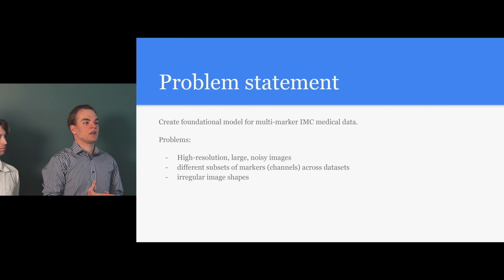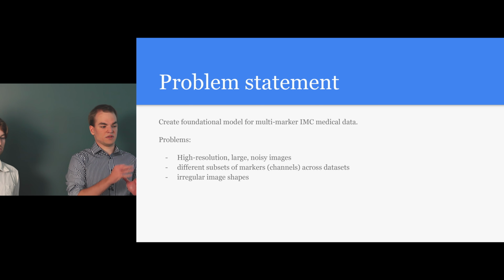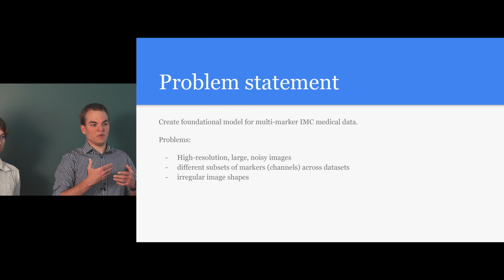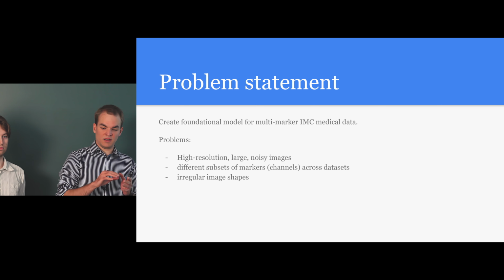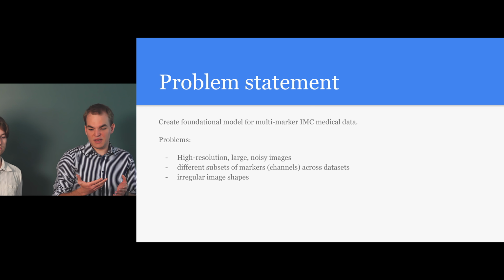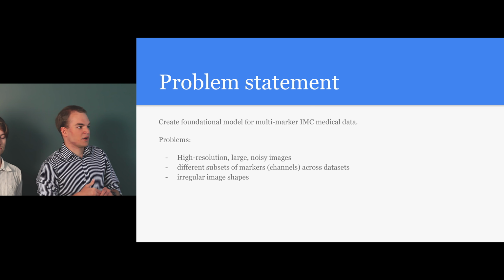They are large and quite noisy because they consist of large amounts of cells. Each patch of the image has a meaning, so we have to take a look at the entire image.